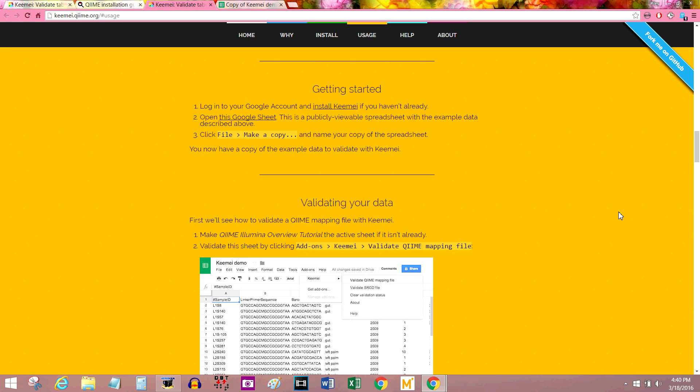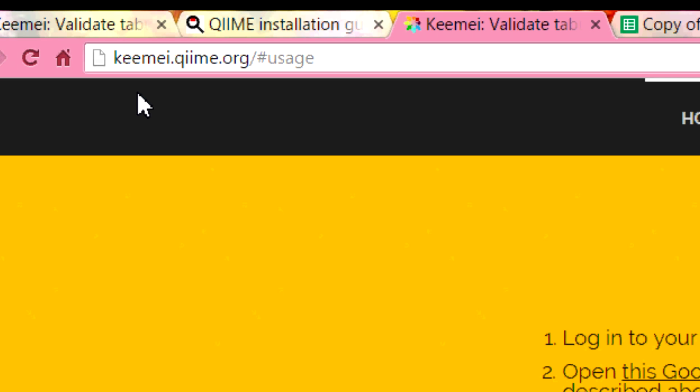Just like last time, we'll be following along with the tutorial on the main Keemei website, which is keemei.qiime.org K-E-E-M-E-I dot Q-I-I-M-E dot org slash hashtag usage is where we're at right now.